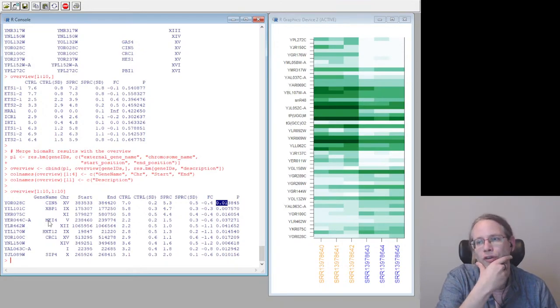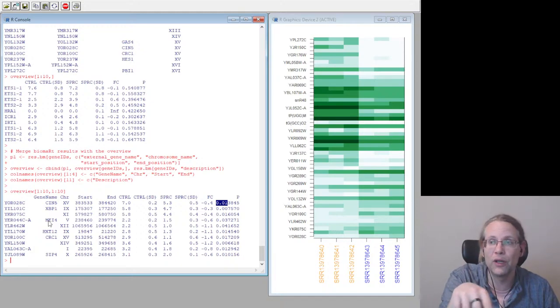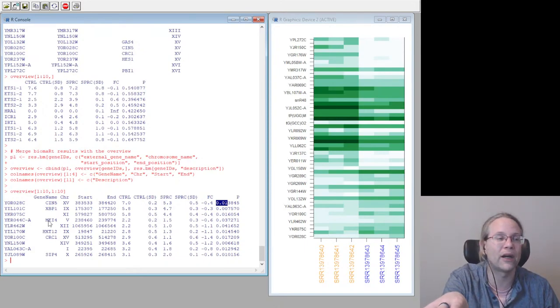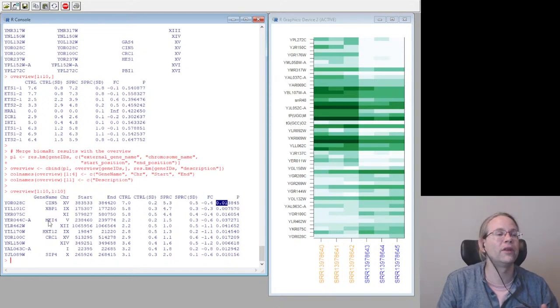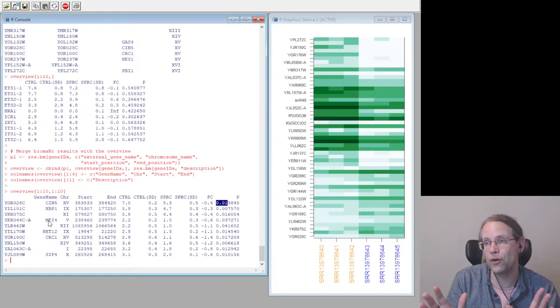Yes, of course. You still can rank the genes based on which one is the most likely to be involved. And when we start doing the gene ontology and the DAVID annotation, then you will actually see that it makes sense. The annotations that come back really point you in the right direction. So it is underpowered, but still with an underpowered study, you can pick out the genes which are most different from each other. So it's not a perfect study.